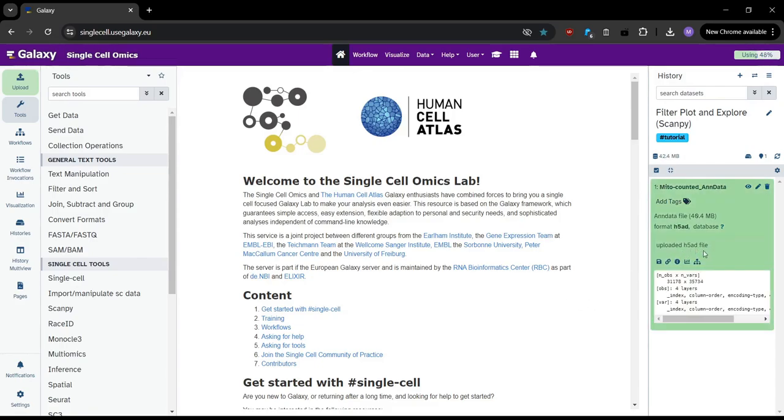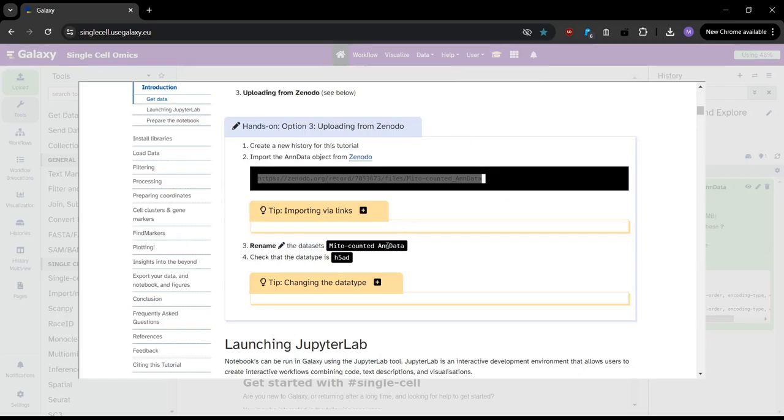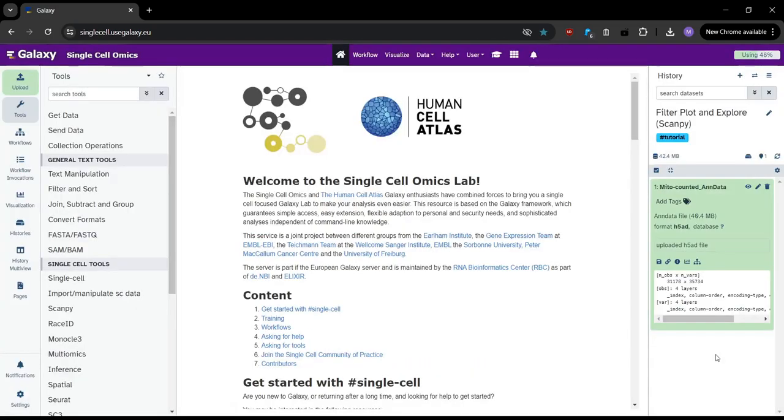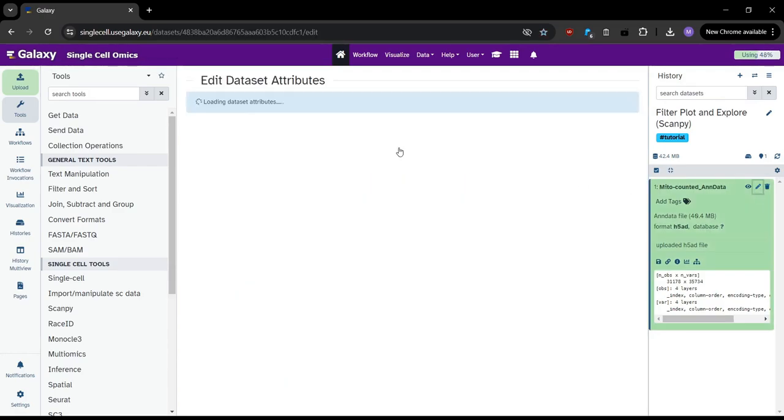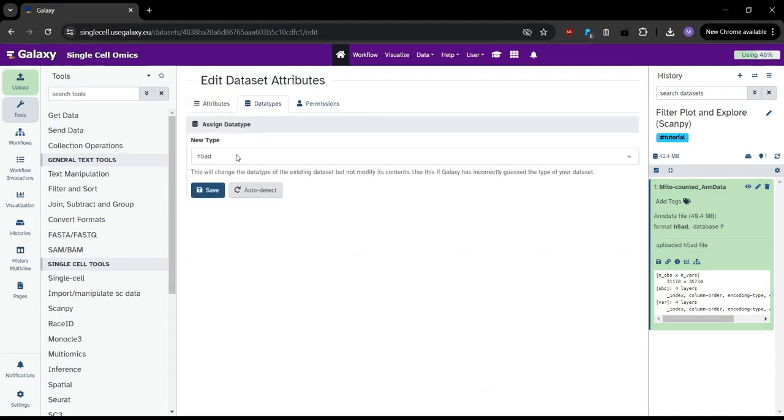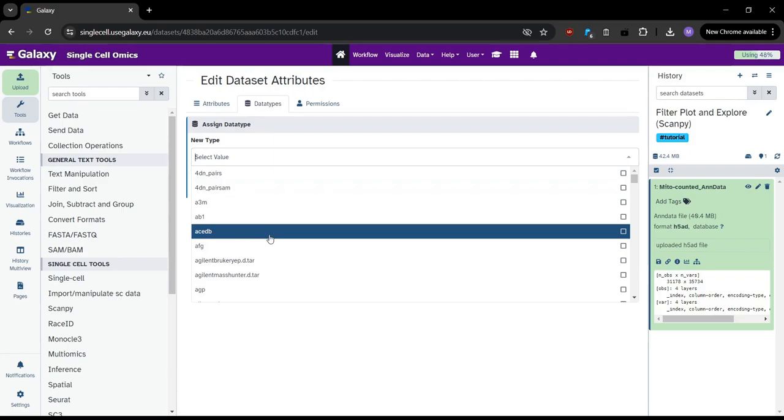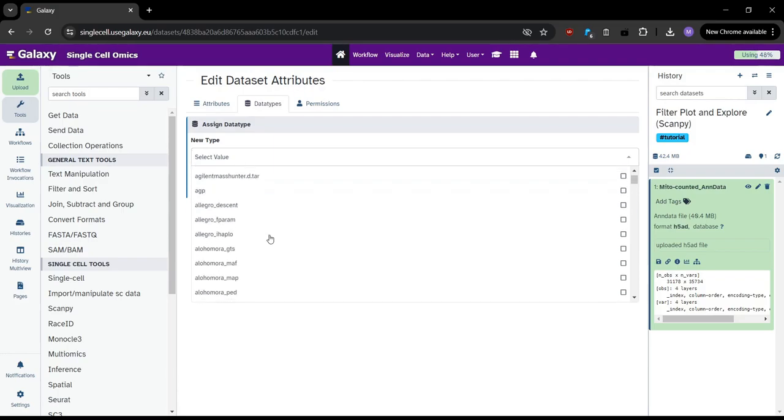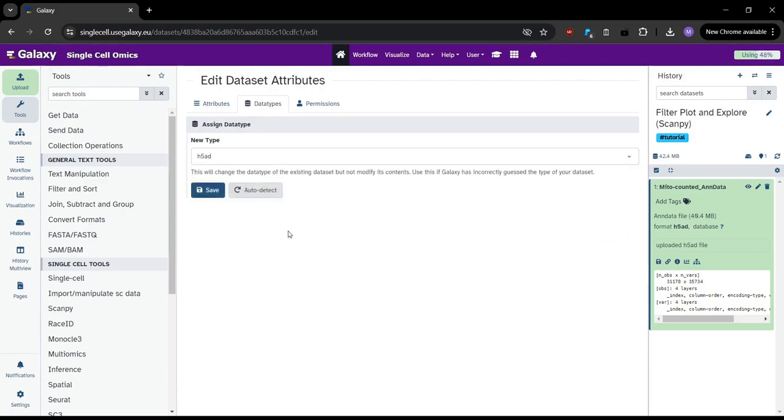Okay, so the data is now loaded. So the next step is to check the format. So if we look in the tutorial, we can see that the format needs to be H5AD. We can go ahead here and see that the format is correct, it's H5AD. In case it's incorrect, we can click on this pencil icon. We can go to data types, and then we can select our data type from this drop down list. Once you've selected it, make sure to click save, and that will change the format. But we don't need to do that because it's already correct.